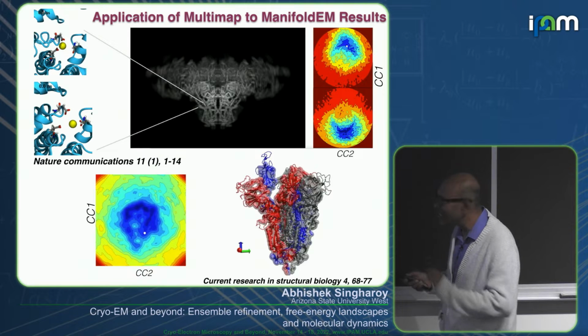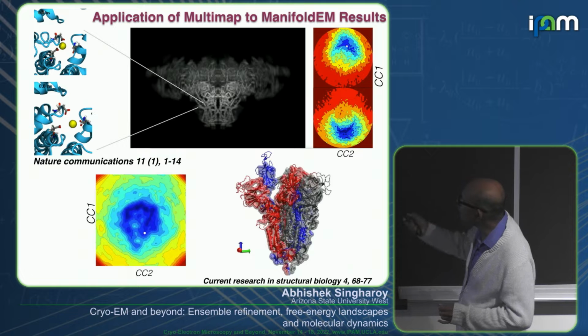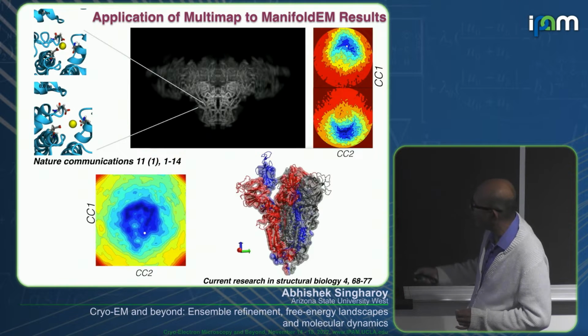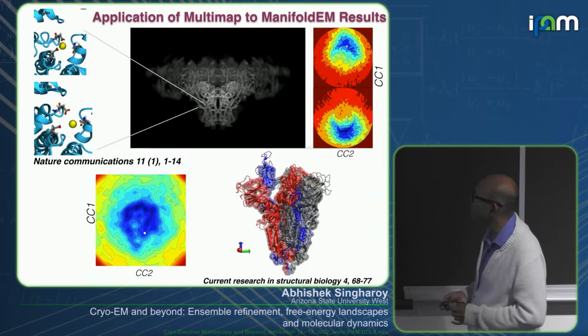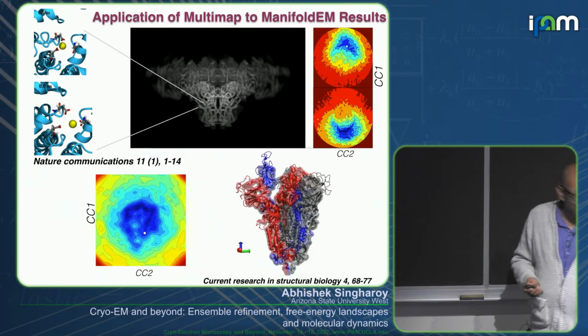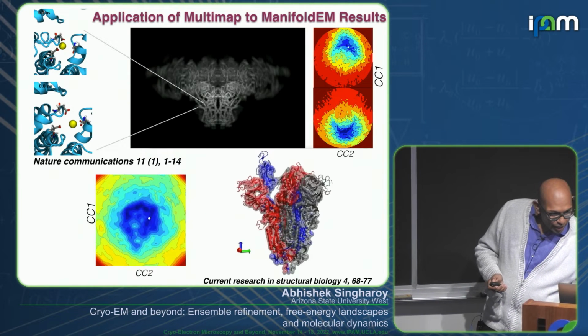The additional point that the speakers have made here is that they can construct these free energy surfaces, and they can say that when we're moving on the surfaces, this is the corresponding structural change that is happening. Now, there are some goods and bads to it. Let me first tell the good things. So, this movie is going to play.